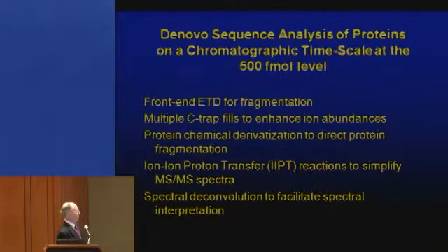And then finally, the last step, of course, would be to deconvolute all these spectra so they can print them out on a piece of paper that runs from here to where Chuck is sitting, and it just has one mass all the way up to 50,000.